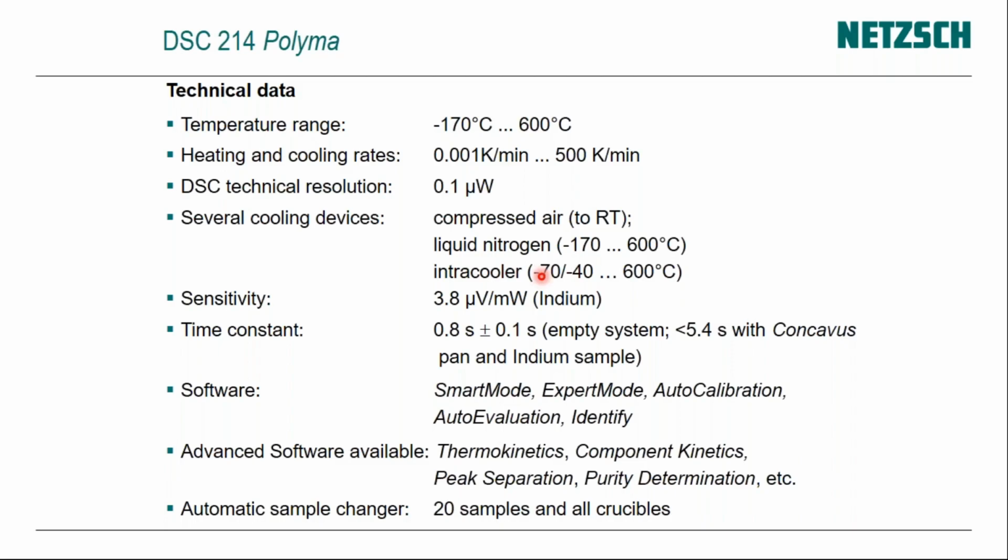When I say simultaneously, it means we have two ports on the rear of the instrument. So you can connect the LN2 cooling system as well as the chiller. So you can select from the software which cooling system you need for your test, either LN2 or a chiller.